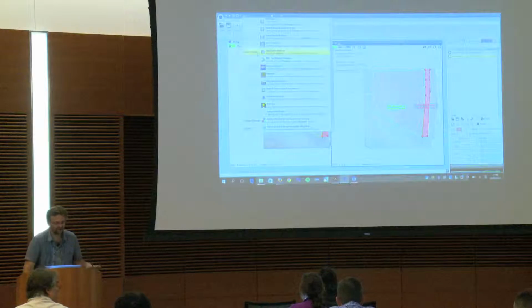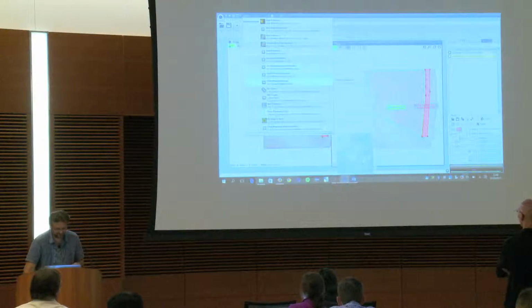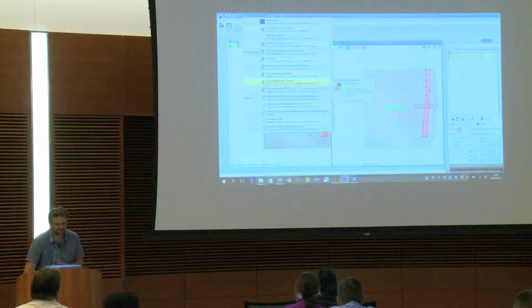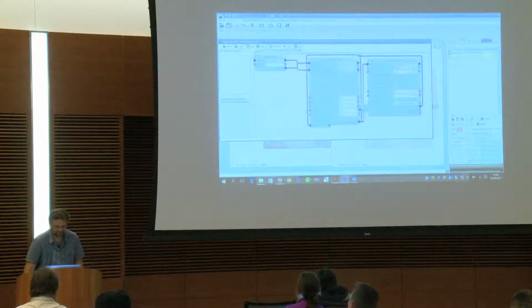Because here you have all the online plugins, and here you have the online protocol. And if you type detect, for instance, you can have a protocol that is doing the same thing as we are doing, but in a graphical way. But we will go back later on this.